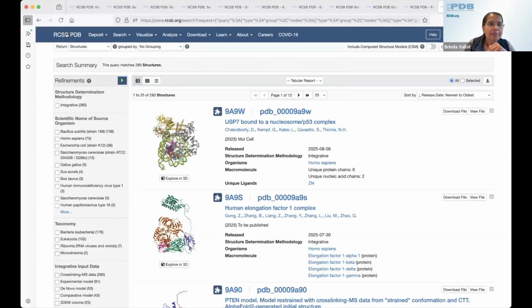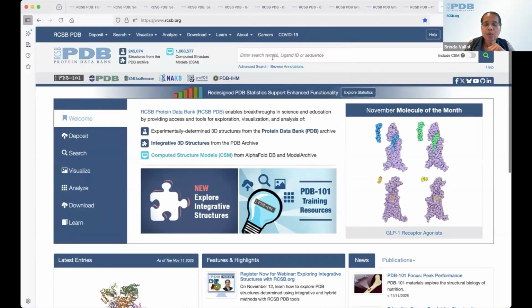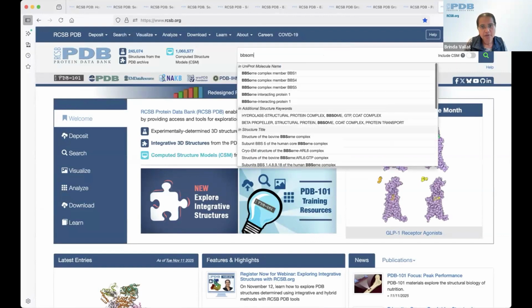All right. Next, let's start with an example on the search bar here. Let's say we search BBSome, which is a complex.